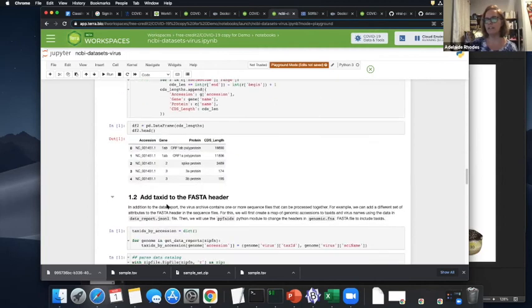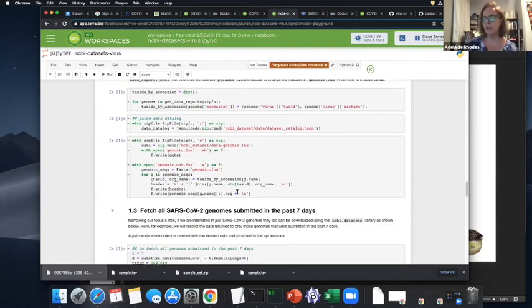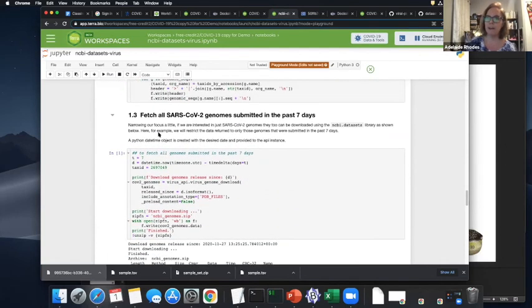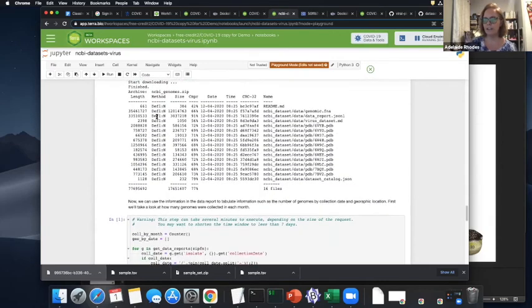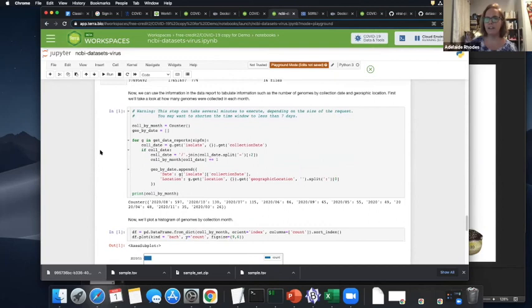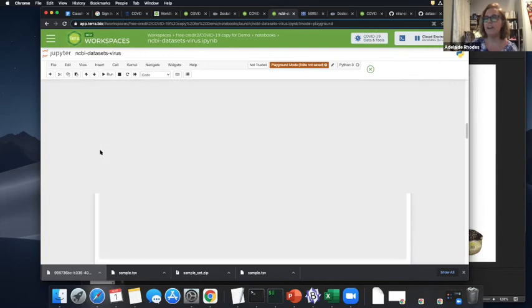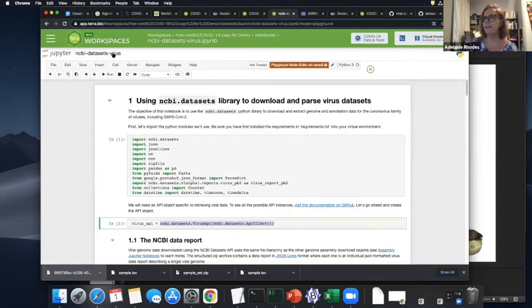So you can imagine that this is a different part of NCBI than SRA, like I said, but you can use these API calls, or the metadata search, or you could use BigQuery. There are so many things we could do with notebooks in this workspace to make the NCBI data a little easier to pull out and start running highly parallel questions on. So that's kind of where I'm at. That's as far as I've gotten today. I would be excited to hear your ideas and suggestions.